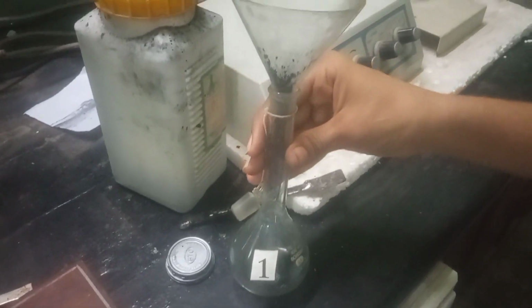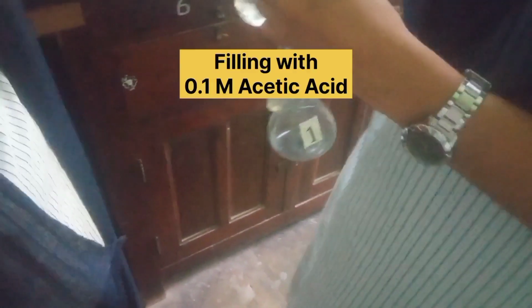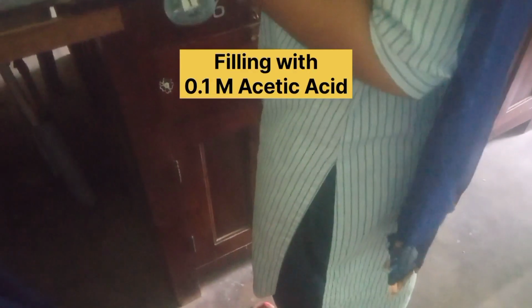Step 1. A weighed amount of charcoal is to be taken in labeled or numbered standard flasks by following standard addition method.